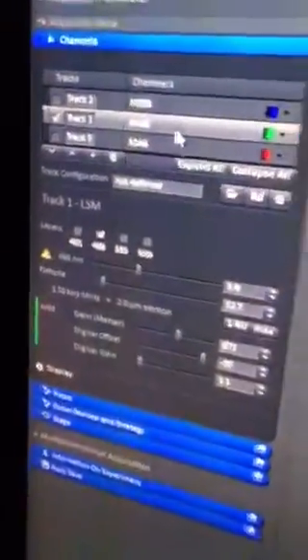So now we're going to stop our process right here, which was a light imaging. We're going to finish with that, and now we're going to use our 488, which is the green wavelength. Click live, and boom, you can see right here, this was what we predicted. We don't really have the dark green here because there's densely packed cells, so there were low levels of CD86, but then here, boom, a ton of CD86, confirming that it was the medulla that we were referring to.